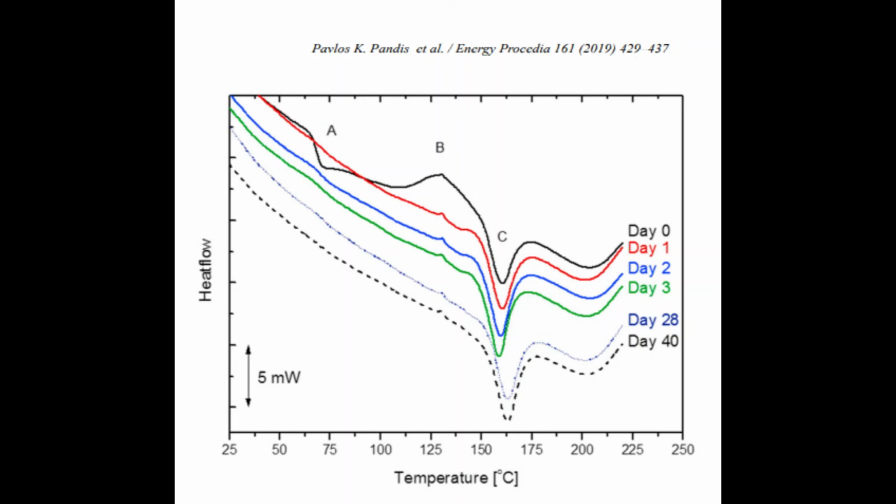Considering the results obtained for the PLA analysis, the conclusions are the following. The first conclusion is that the samples are stable in terms of mass. This is because during the whole process, the mass increased by a very small percentage, and by the 28th day, the mass was completely stable and did not increase more. The second conclusion was obtained by using the differential scanning method, and this showed that the PLA improves its crystallinity over time when working at 65 degrees Celsius.